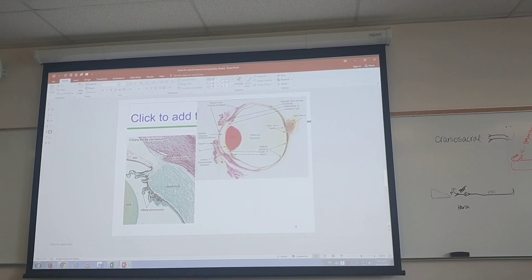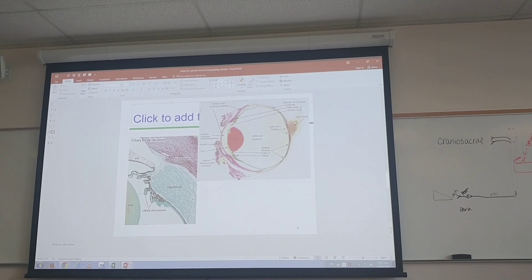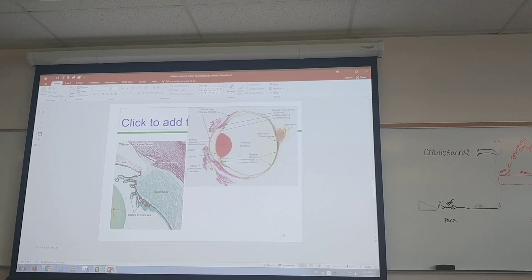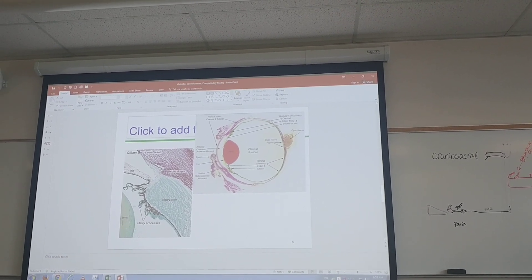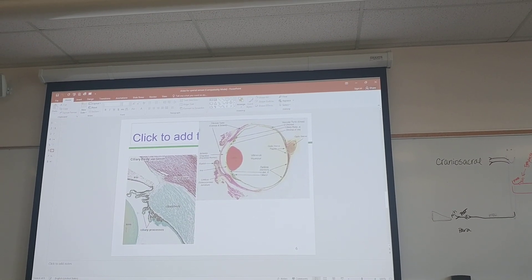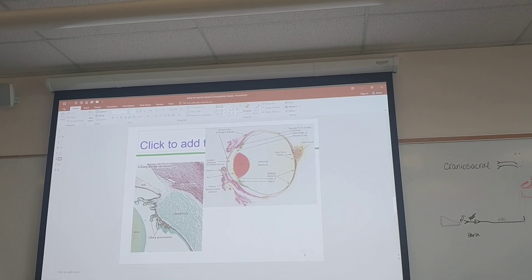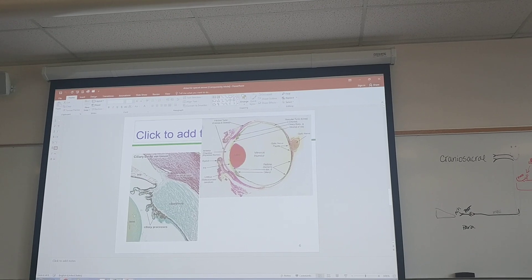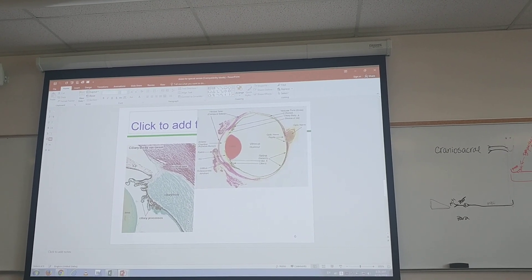We're going to look at the eyeball. We have two slides here. Once you get this it'll actually be really large — go into 10X and look at the different parts. We're going to take this spot and move to 10 or 40X. From here we can see the choroid or vascular layer. We also have the ciliary body with little ciliary processes coming out. You won't be able to see the suspensory ligaments, but right next to it is the lens. Then there's a long, much bigger structure — this is the iris. A lot of times it's actually brown all the way through.